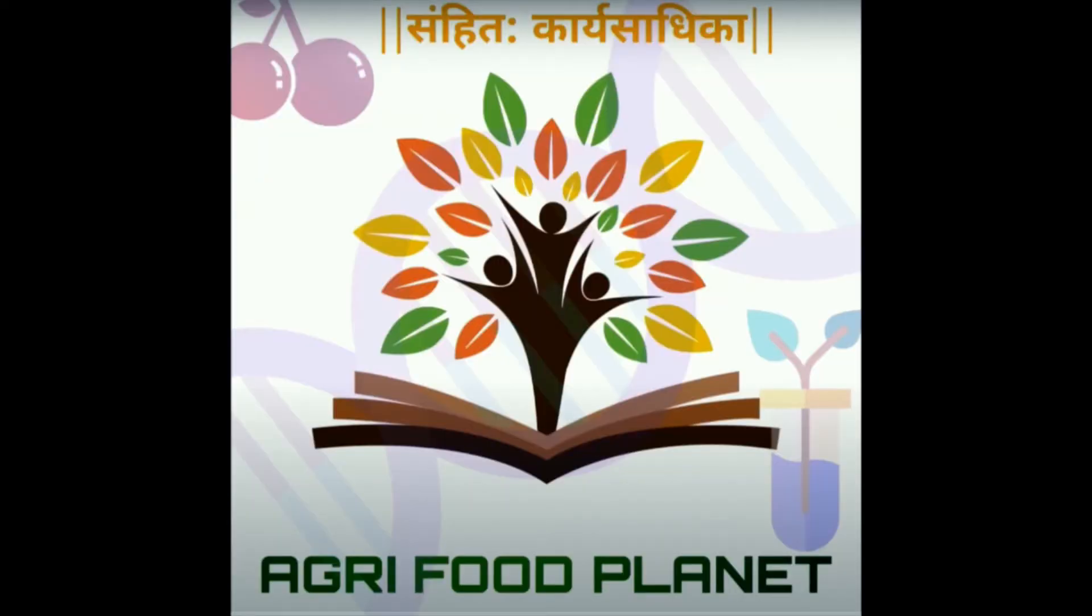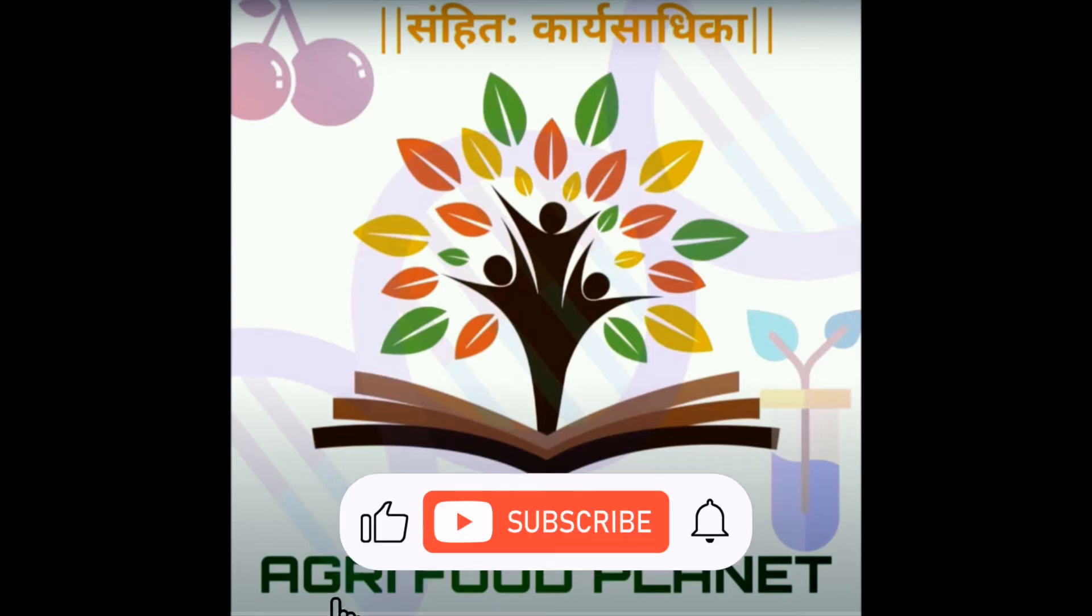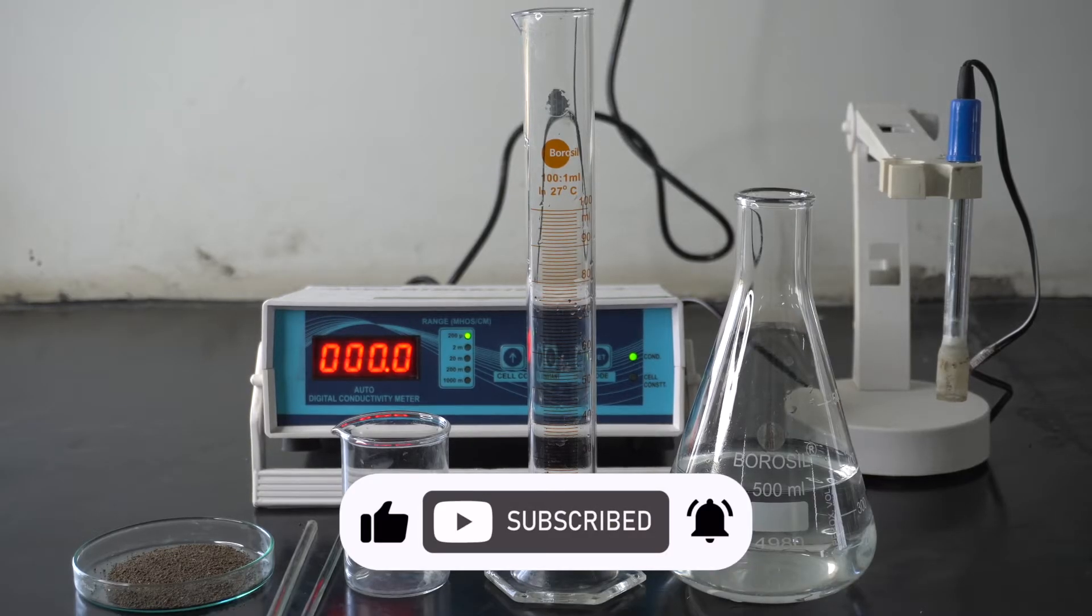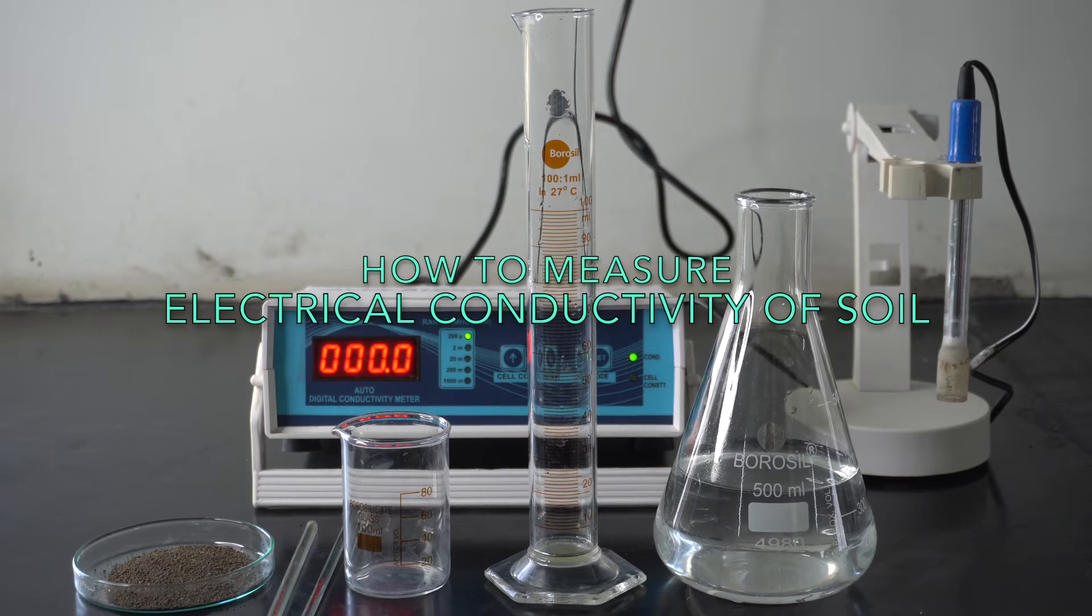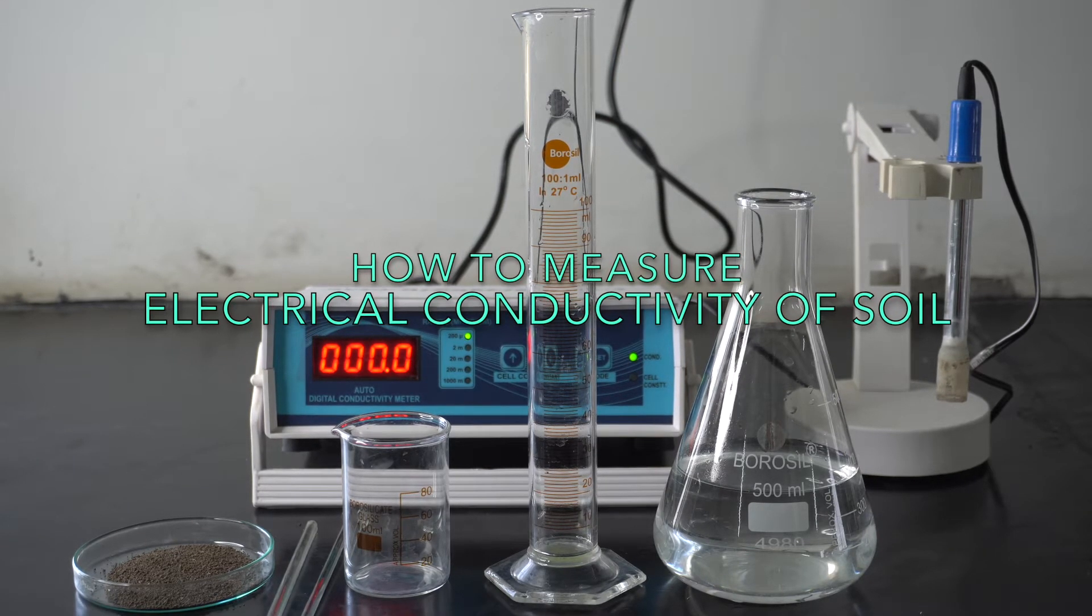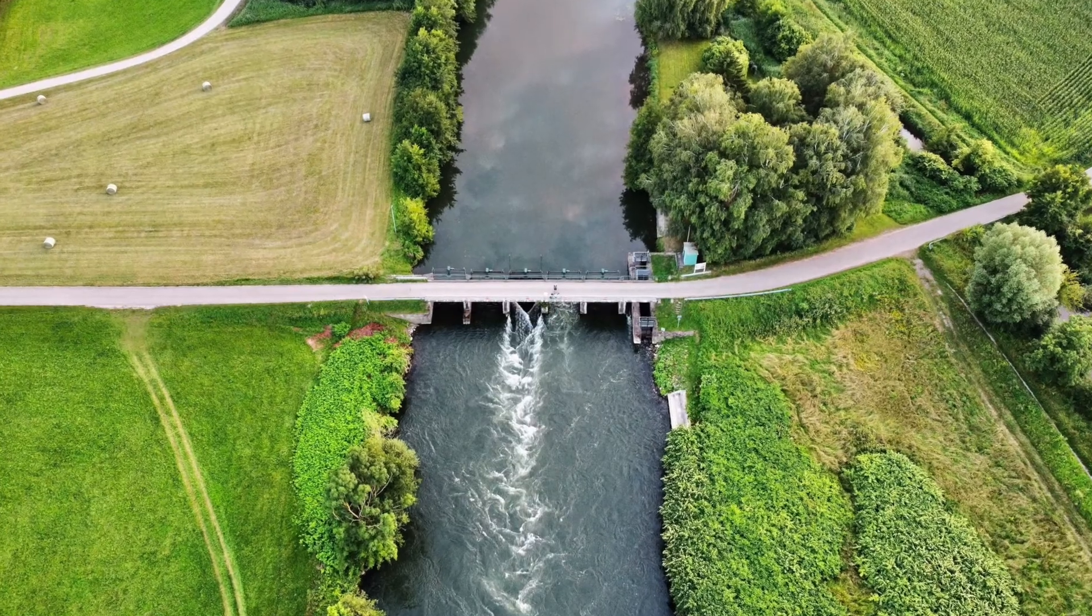Hello everyone, welcome to Agri-Food Planet. In today's video, let's get to know why electrical conductivity of soil is important for farming and how to measure it in laboratory.